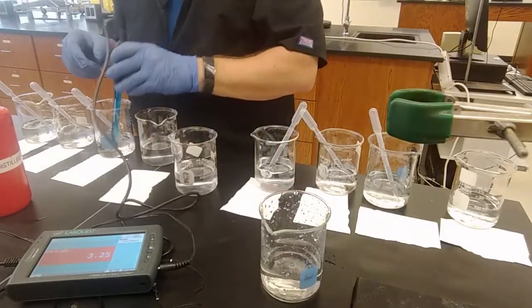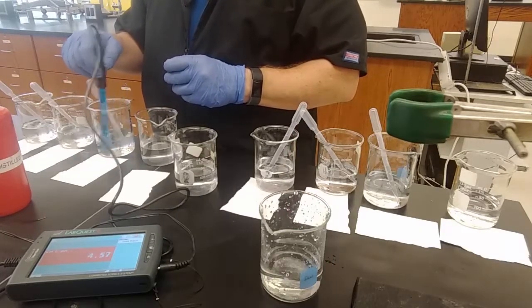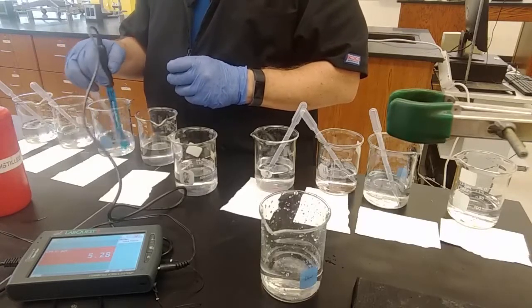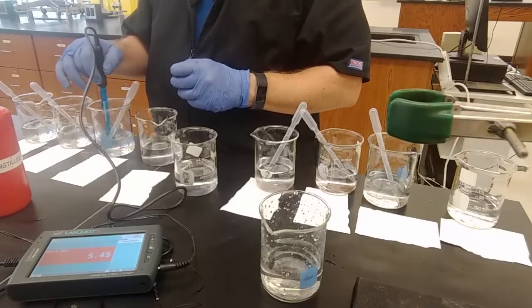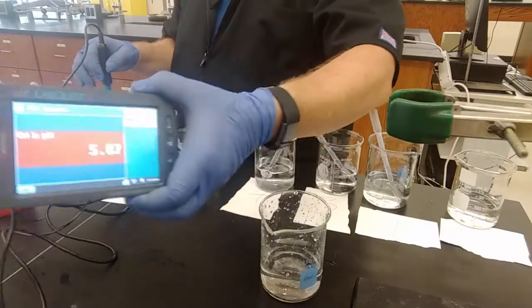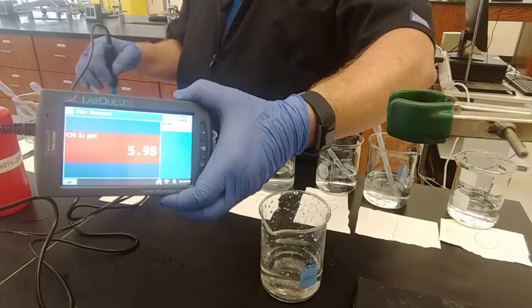Let's check 11. See where the base ends up overwhelming our not deionized water. Still not yet. It is more basic than the 10, which is what we would expect since we made 10 from the 11 by diluting it with very acidic water that should have been deionized. But we're still only in the pH 5 range. We're expecting a pH of 11, and we're seeing a pH 5.